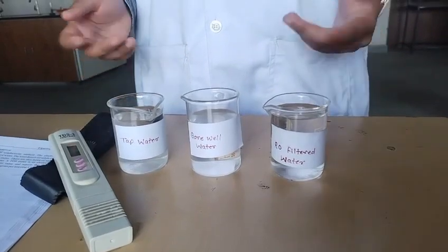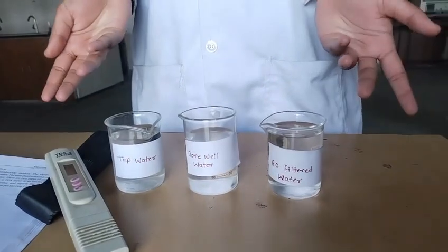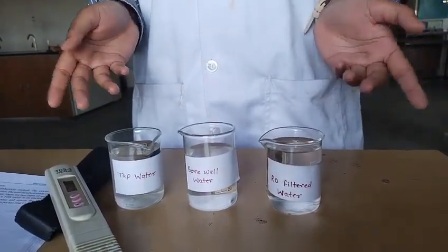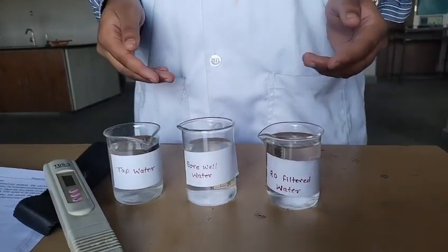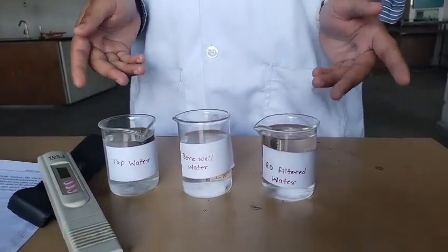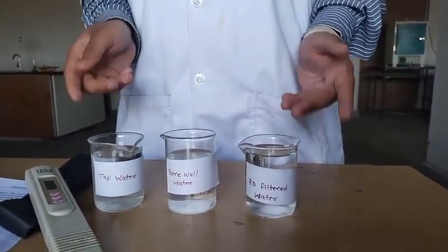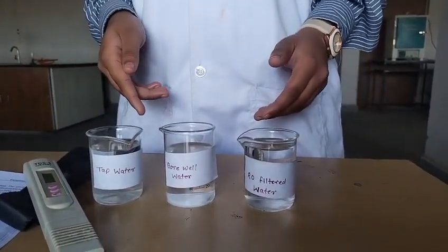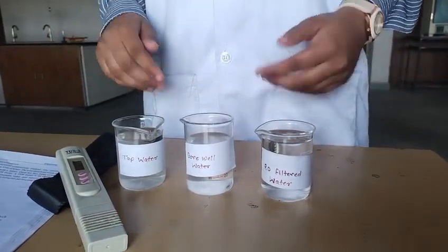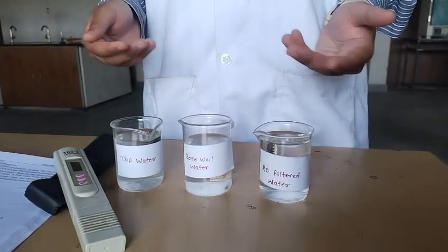We know the importance of water in our life cannot be overstated. There would be no life on our planet without water. We require water for a variety of reasons. Water is required for drinking, industry, irrigation, swimming, fishing and other activities. Water must meet specific composition and purity requirements depending on its intended use.